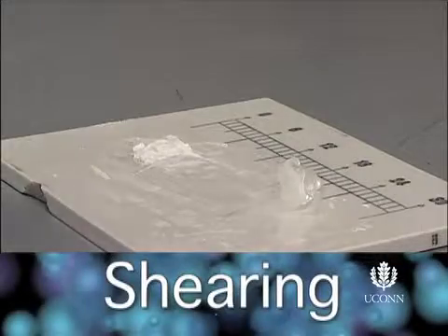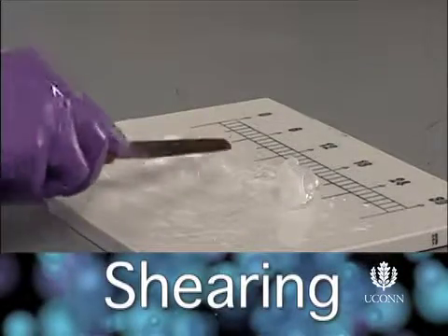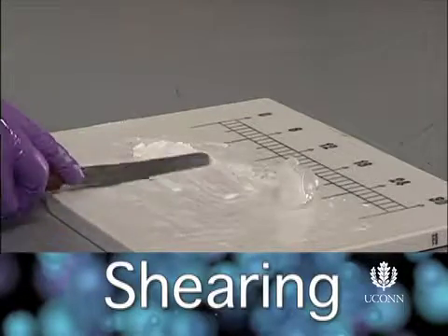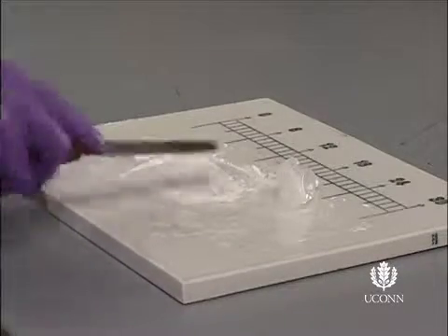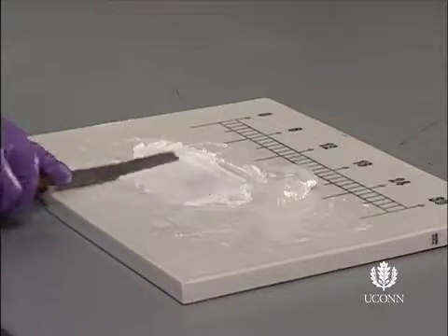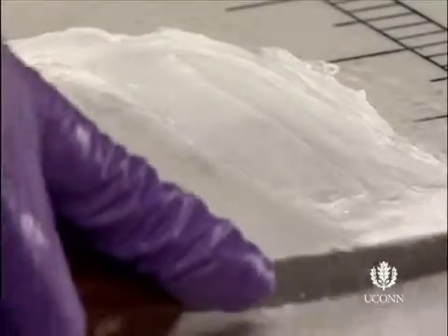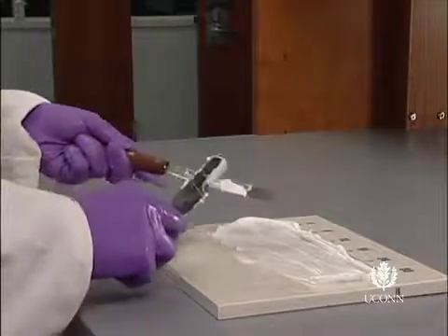It is best to mix the ointment by picking up the base with a medium-sized spatula and then spreading the ointment across the entire length of the work surface. This process causes shearing and is used to further reduce particle and agglomeration size. It is important to use the entire length of the work surface, as the same force applied by the spatula will shear a thin layer of ointment more than a thicker layer of ointment. In other words, the thinner the layer of ointment, the more effective your spatulation.